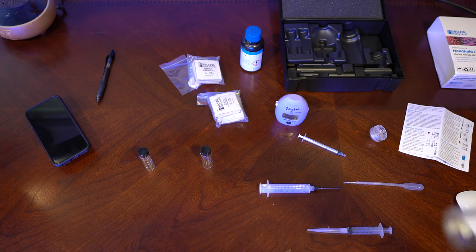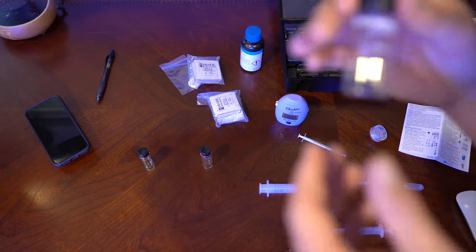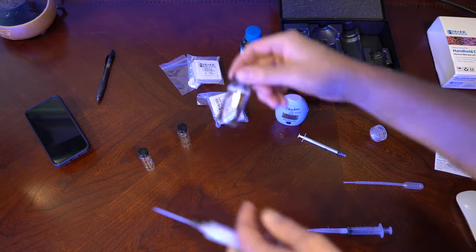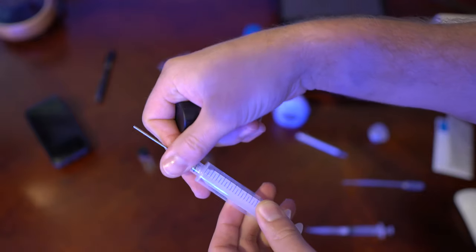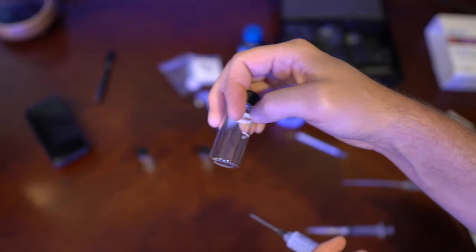We're talking about very small particles, so you want to make sure this is completely clean. Even the first time you use it, you want to rinse out your syringe and rinse this out with the water that you're testing. The first step is you need to take this big vial. You're going to take this syringe — it doesn't really matter what you use — you just need to make sure you put exactly seven milliliters of your tank water that you're testing for nitrates in here.